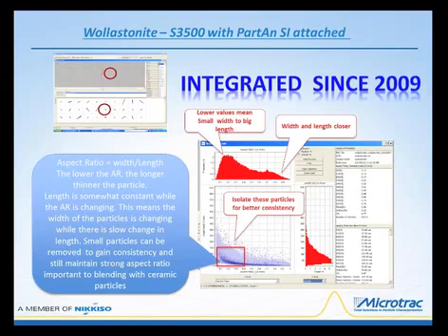Now, the other thing I did was to put this together in a full scattergram. Now we have the aspect ratio information, and we also have the length information plotted on the same graph. Supposing the manufacturer wants to have a very highly consistent product, or at least monitor and know how the length and the aspect ratio, which apparently is important to this material because of the shape of the particles, behave, they may want to isolate on this particular area to make a consistent product.